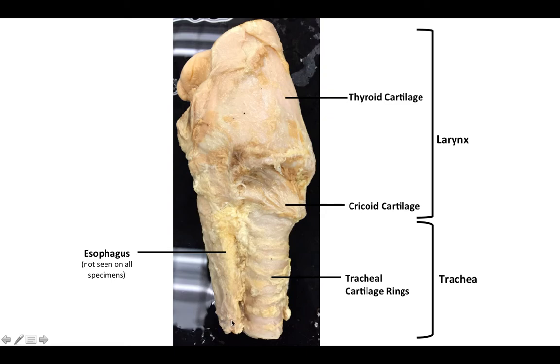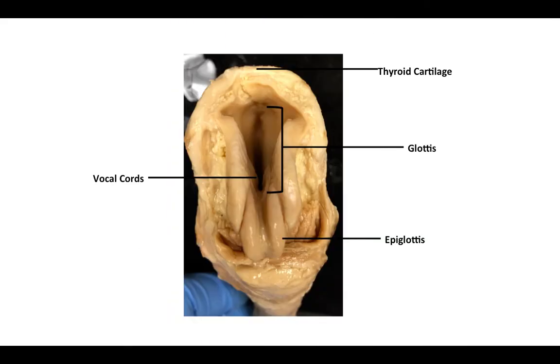Make sure, as always, when you're looking at fetal pigs or any specimen, the larynx or the stomach, look at as many different models as you can so that individual variation won't throw you off if you get a slightly different one on a quiz or exam.